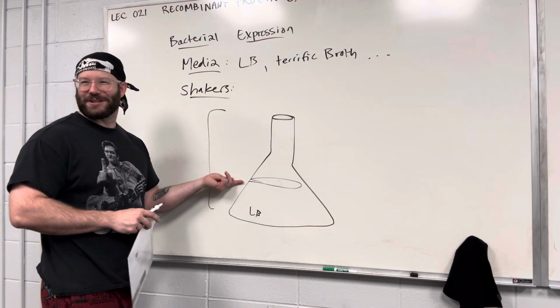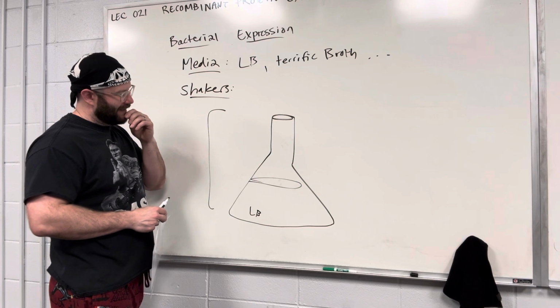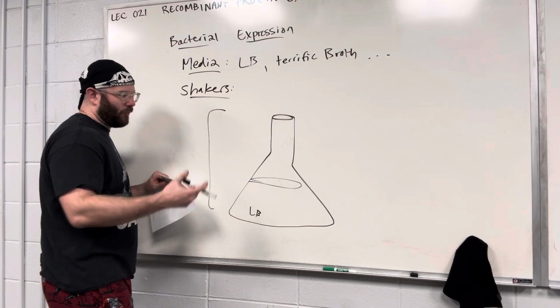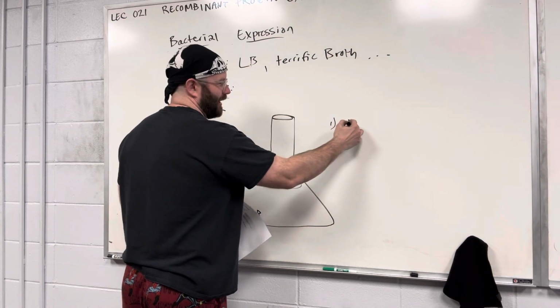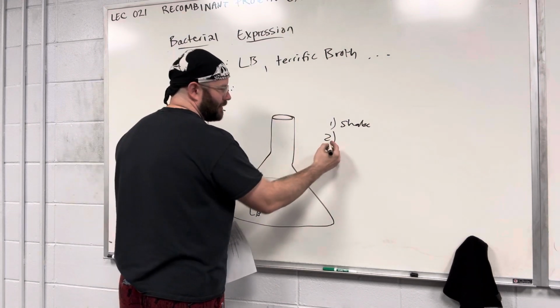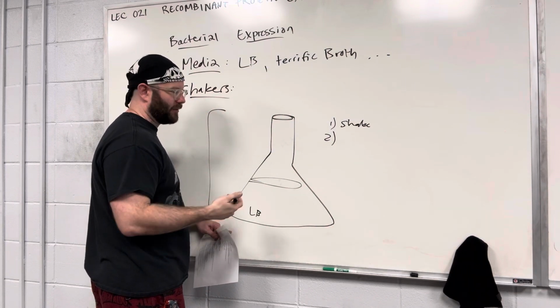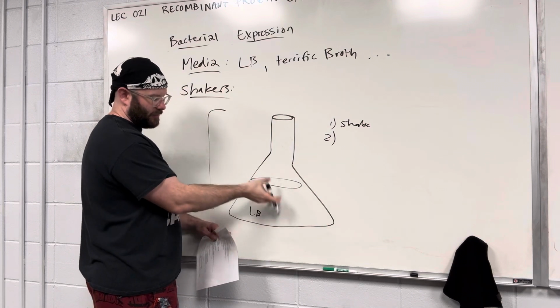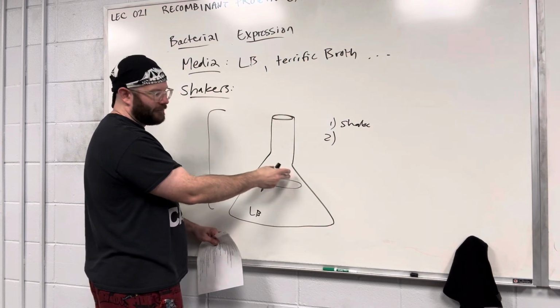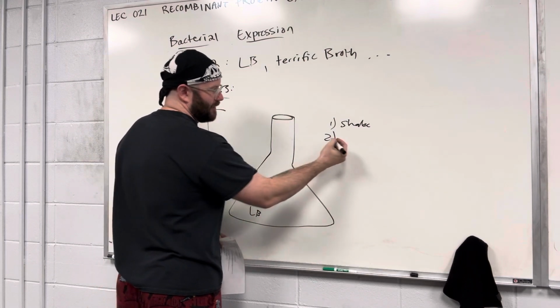Why do you only fill it halfway? Was that just a guess, a good guess? To leave headspace. Right? Why do you leave headspace? Well, I don't know. Okay, so this is good, because I'll actually explain. There are multiple reasons. One, this is going to shake, so you don't want it spilling everywhere. That's bad. Two, E. coli like oxygen. E. coli essentially need to breathe. So in order to get oxygen distributed into the media, that's why you shake it, and that's why you leave it half empty, so that there's enough air in here that when it shakes, you can get good aeration. So you need oxygen.